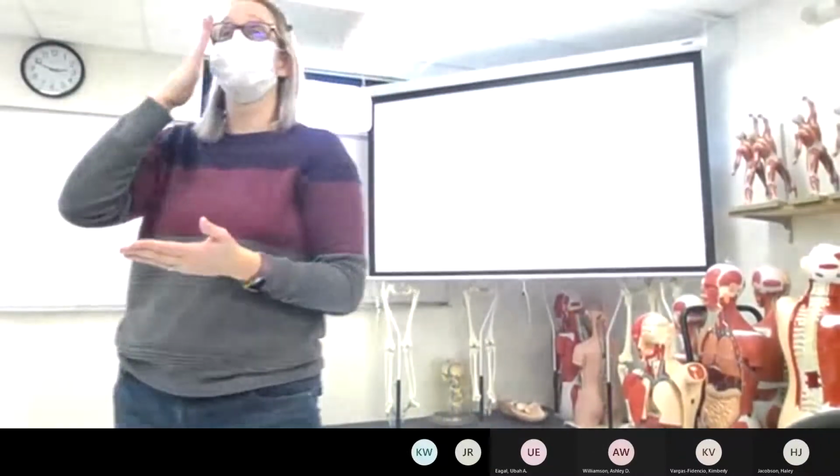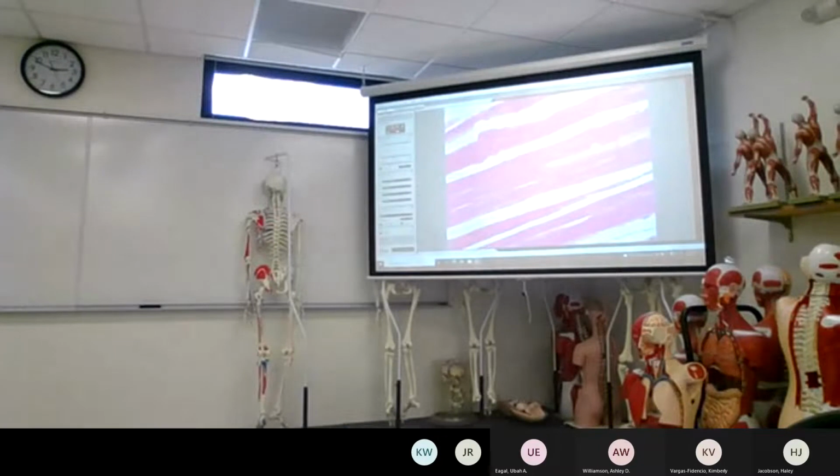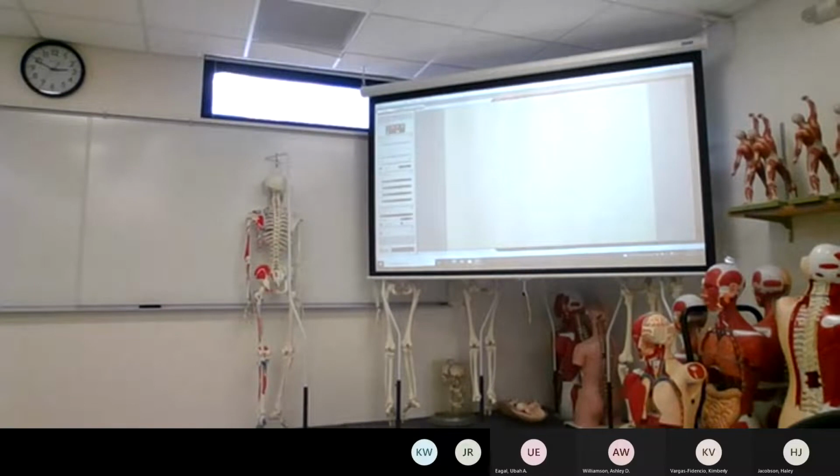So your skeletal muscle cells are technically not touching each other. They're nice and long and they have multiple nuclei. You can't see it very clearly because it's lost in translation, but hopefully when you look at it on the microscope, you see the striations created by the sarcomeres. Remember, this is under voluntary control. This is usually going to stain red because it's large in blood flow, and inside those cells are a lot of proteins that collect oxygen, and they have iron cores called myoglobin.